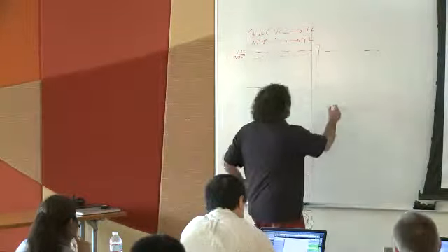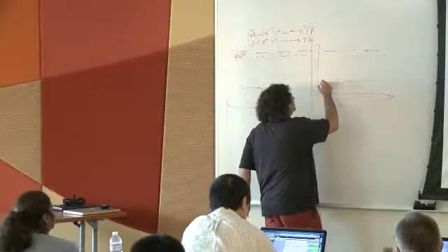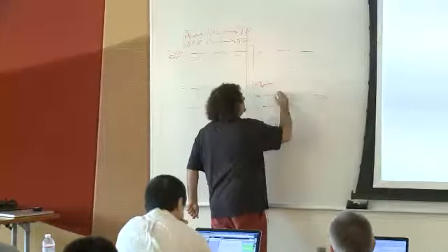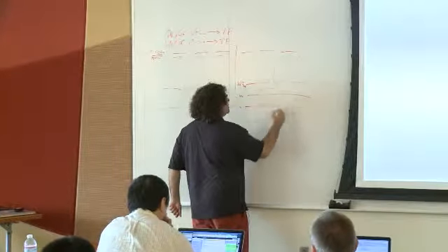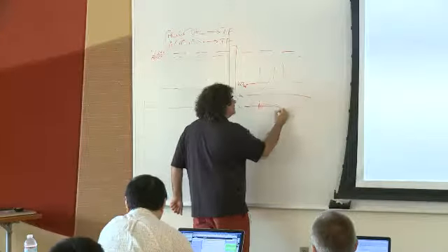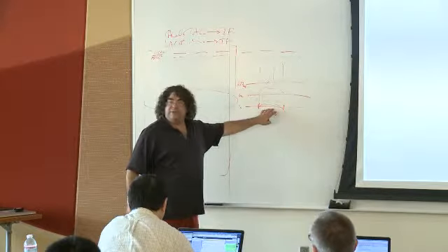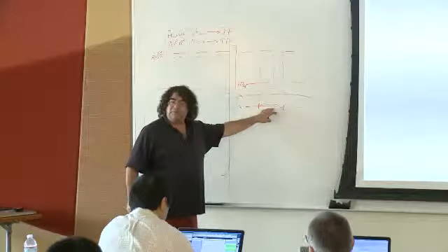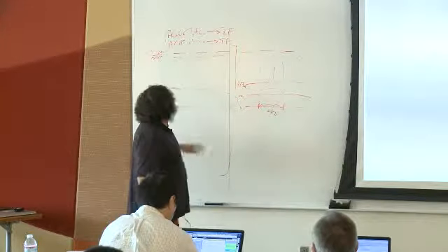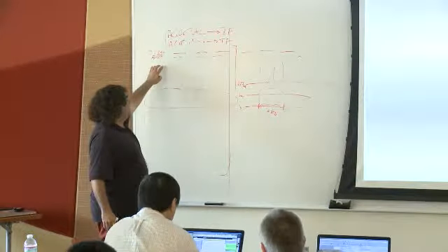Okay. So we find in this region, if we put K27 acetylation, K4me1, K4, that there's a peak here and some other peak like that. You say, okay, this is what we call the enhancer element. So that would be 2 KB. Now the sequence of this we don't get from de novo sequencing. We use the reference genome.